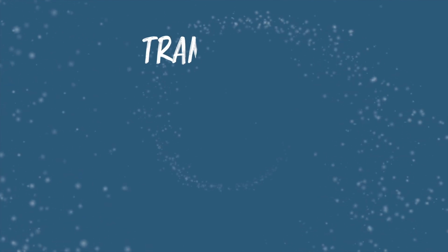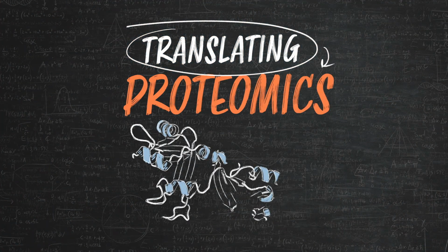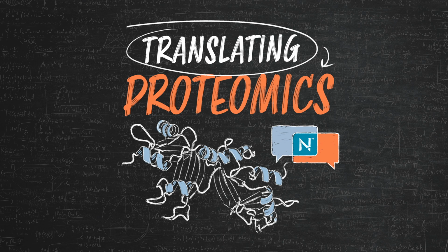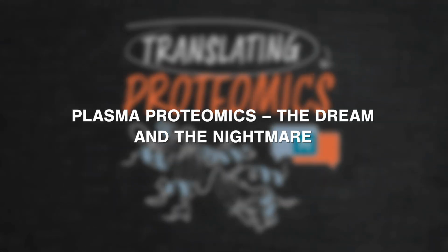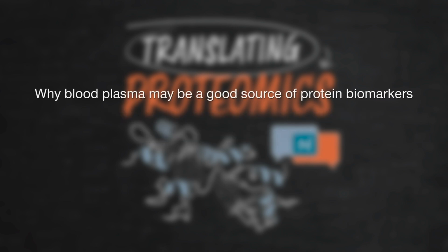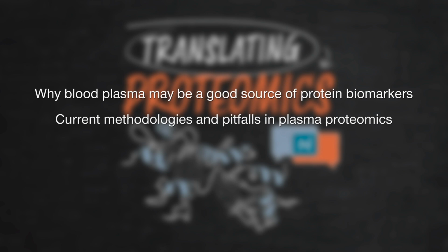On this episode of Translating Proteomics, hosts Parag Mallick and Andreas Huhmer of Nautilus Biotechnology discuss the challenges and opportunities of plasma proteomics. Their conversation focuses on why blood plasma may be a good source of protein biomarkers, current methodologies and pitfalls in plasma proteomics, and the path forward for plasma proteomics.